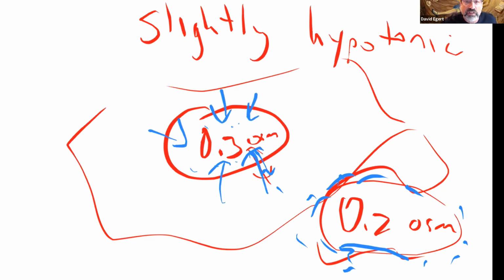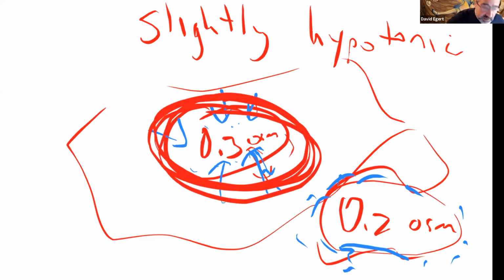Similar to what we saw with the osmometer, with the 20% across versus the 40% across the membrane. It comes in, but not as fast or with as much force. So it might just swell, and maybe we're going to inflate the cell, but not actually explode it. So you can have hypotonic, but not have hemolysis. It could be that it just swells if it's slightly hypotonic.